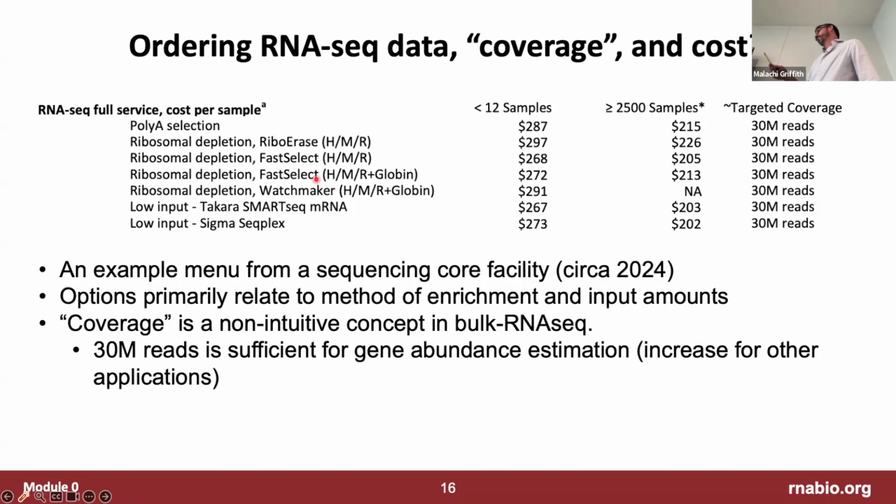And so every transcriptome analysis should start with some kind of analysis, like a principal components analysis view of your data, where you look at the broad strokes pattern of transcriptional expression of all of your genes in each sample, and then you label each sample with different things, like your condition A that you're hoping to compare to condition B. Do they seem to separate? Is A really distinct from B, and my replicates of A are all similar to each other, and my replicates of B are all similar to each other? Or are they all blending together? Are there outliers? Does it look like I've swapped some of my samples, that kind of thing?